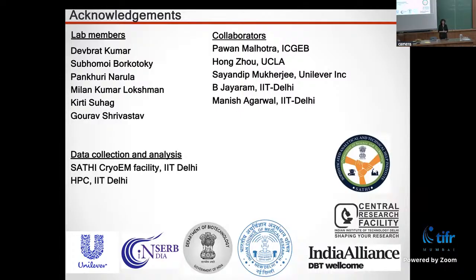That's a very good question, because when we are doing structural biology, definitely X-ray crystallography, we think that the particle is existing in a very static state. The advantage of cryo-EM is that if the particle was existing in 50 different states, perhaps some of the frozen states represent one of those 50.